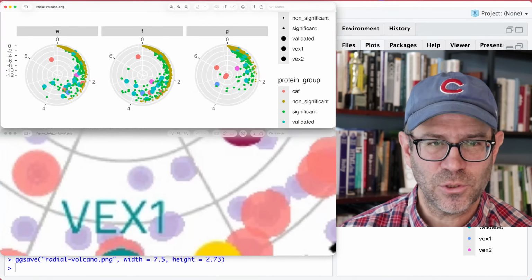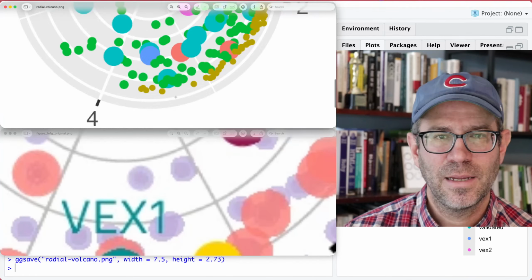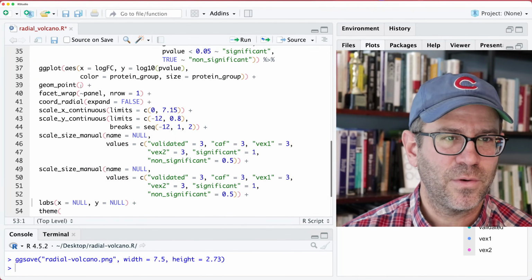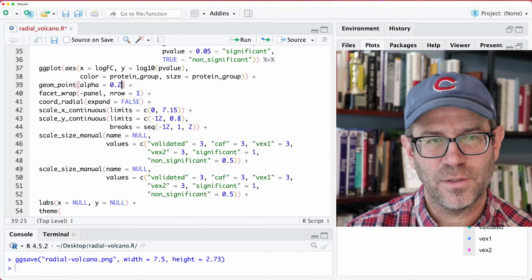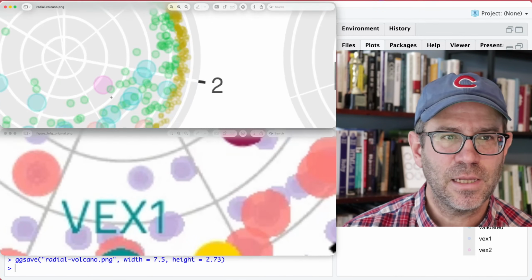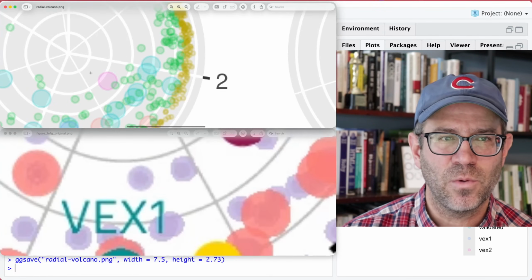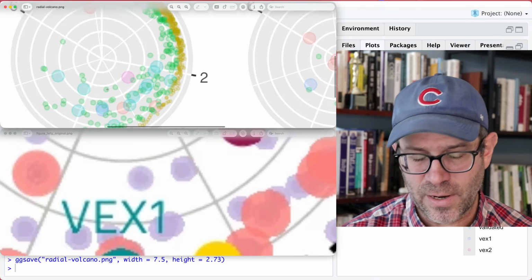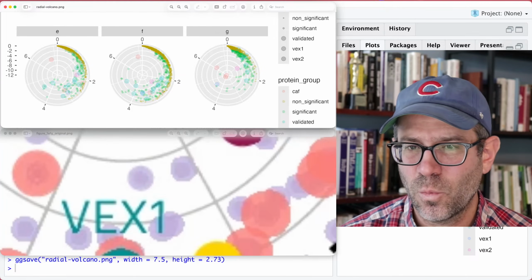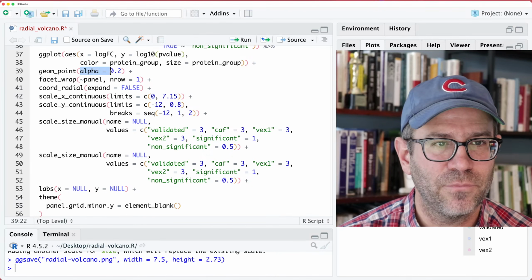And so what I'm showing in mine, if I go to the same area, these are opaque, but if I were to do alpha equals 0.2 and zoom in, there's no point behind that, right? Something you do see is this kind of radius around it, and that's an artifact of the alpha, which I don't know why it does that. It's kind of odd, but so I'm going to go ahead and turn off that alpha.